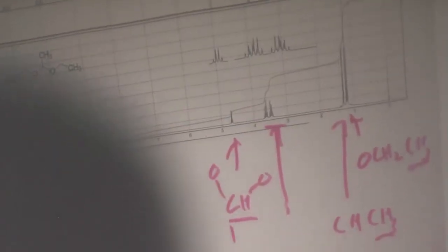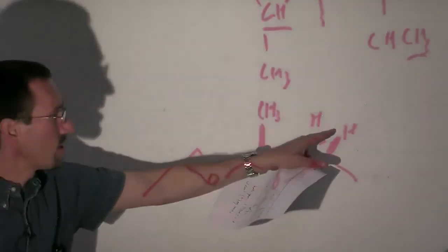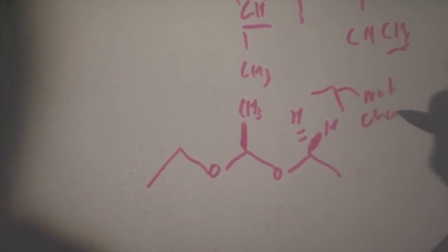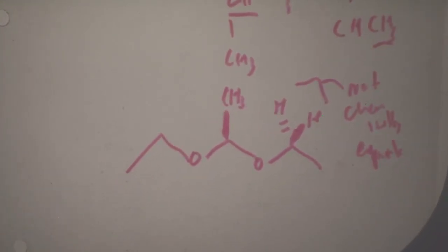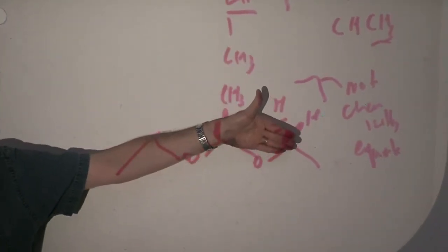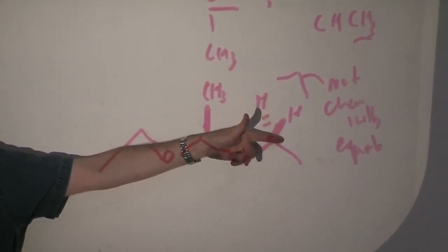And it takes a moment to wrap your head around this. And to wrap your head around this, what you have to realize is that these 2 protons are not chemically equivalent. You can think of this a couple of ways. They don't exchange by a symmetry operation. If you reflect through the plane, you don't get the same thing.